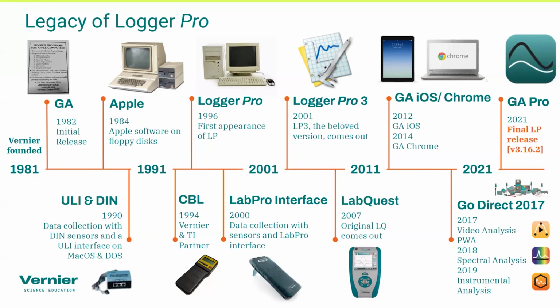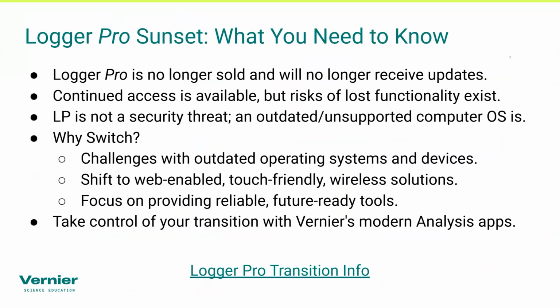So what we did was we decided that we needed to announce to all of you that Logger Pro, even though we're no longer updating it, is also no longer being sold. And we know that that's going to be a tough pill to swallow for those of us that have kind of grown up with Logger Pro over the years and that has been our go-to for data collection.